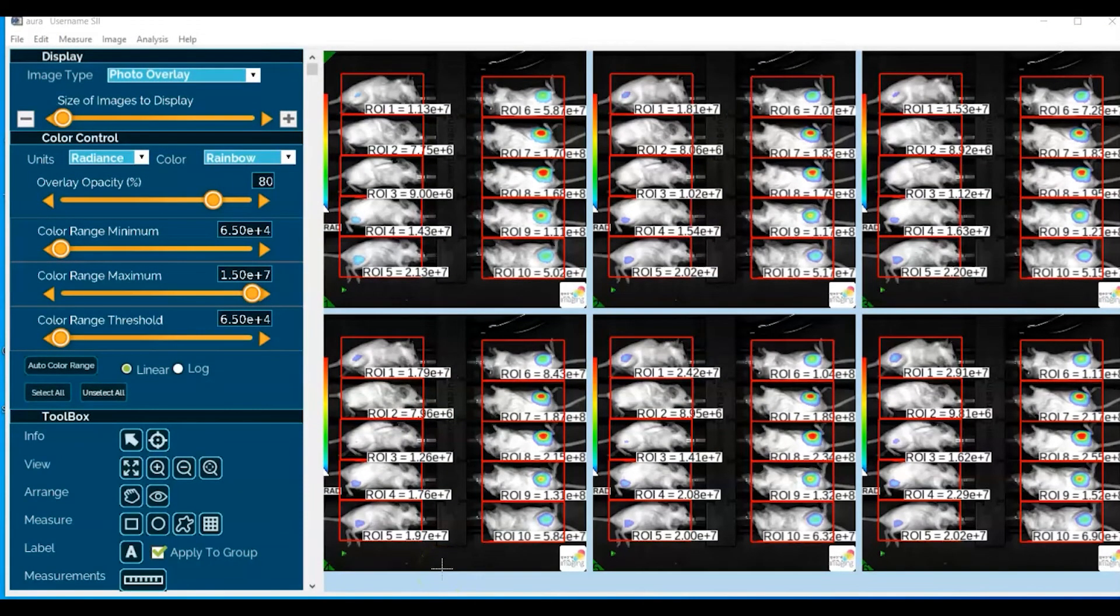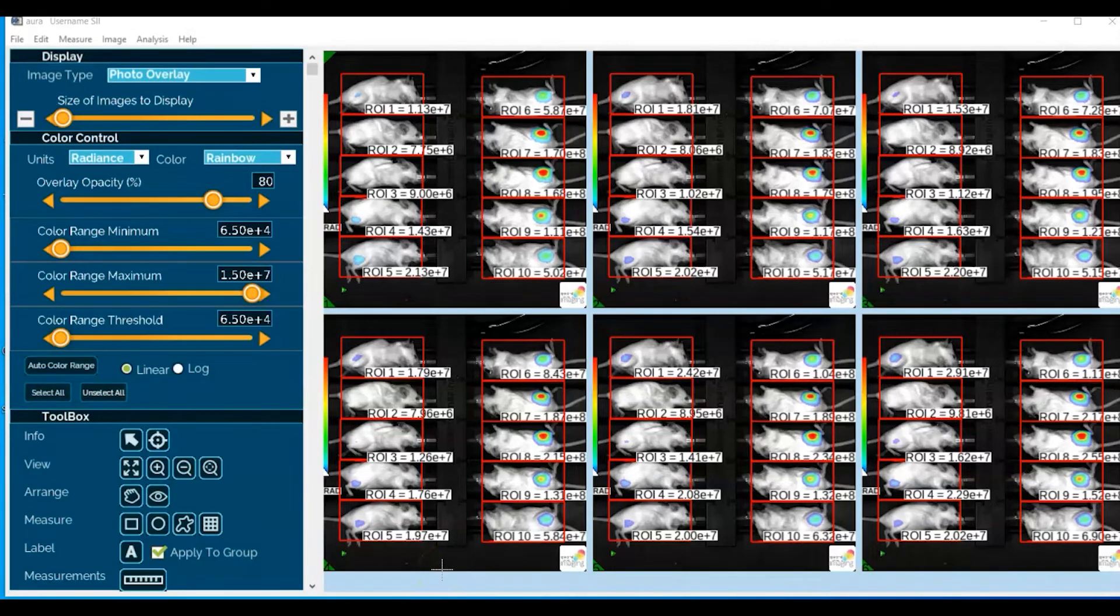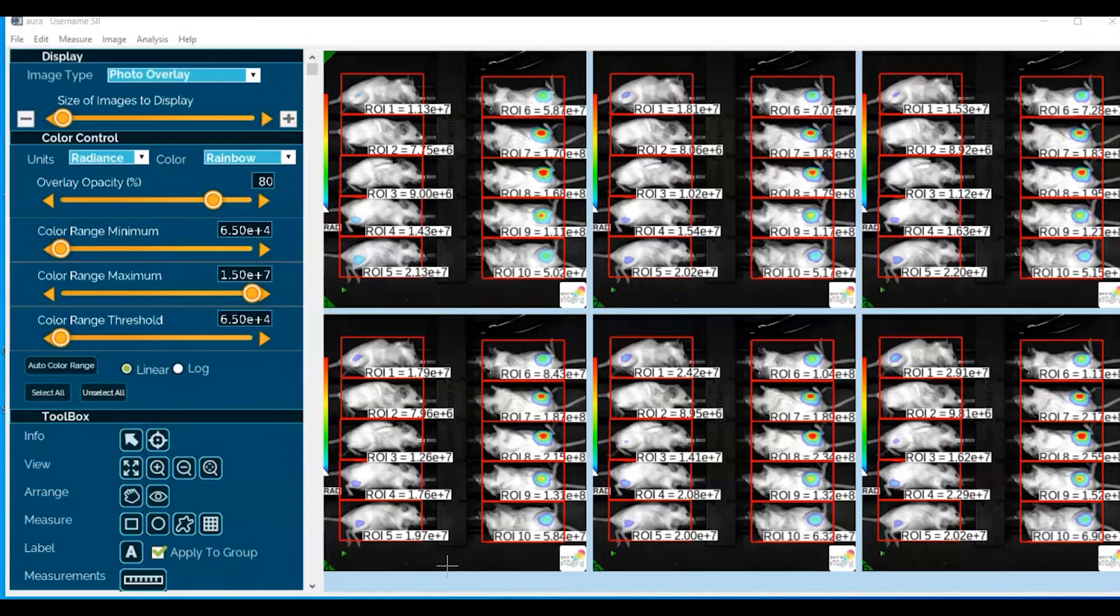One final activity that most investigators will do is to go ahead and take a picture of the images that they've done their ROI analysis on.